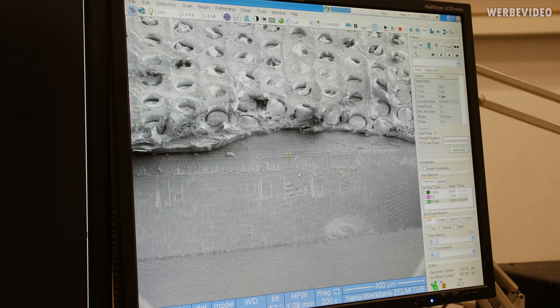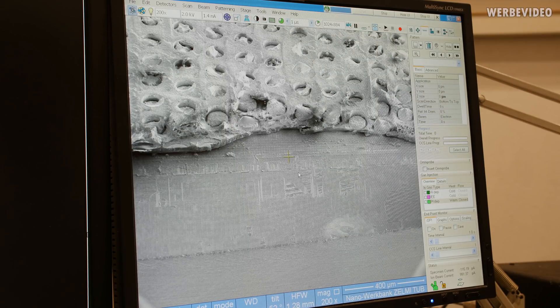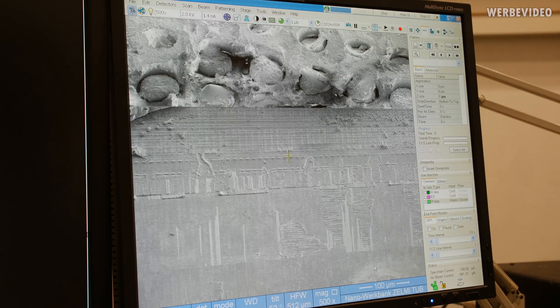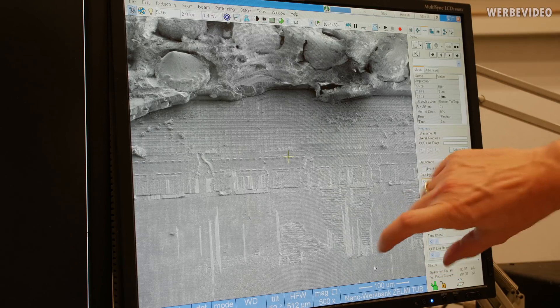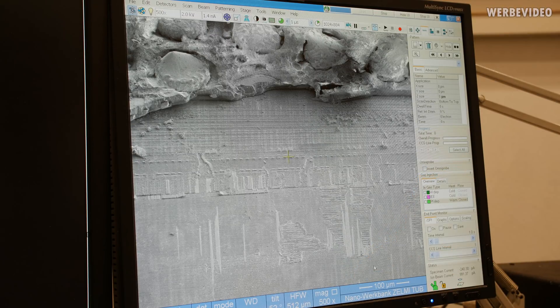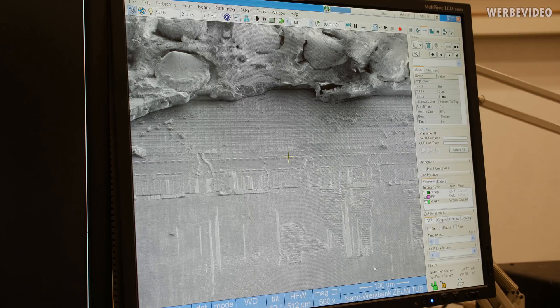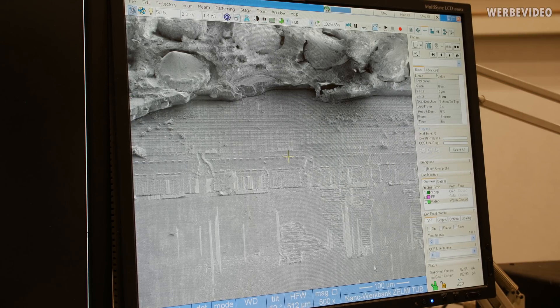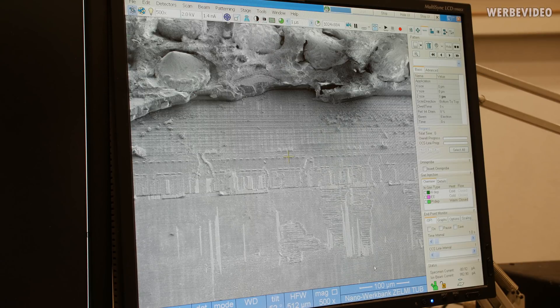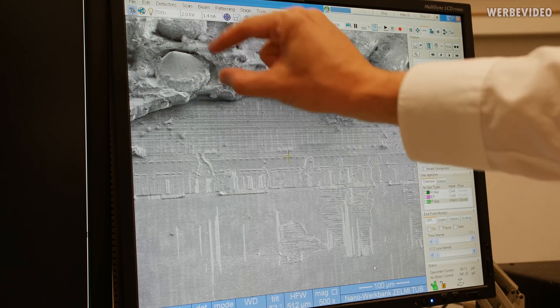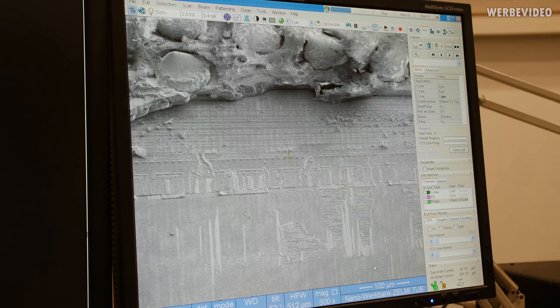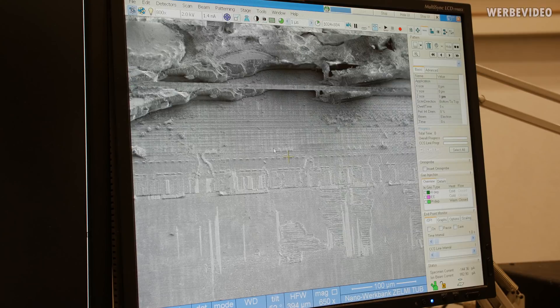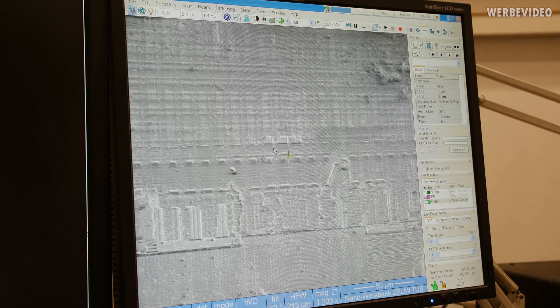Can you give us a relation to what kind of magnification we are looking at currently? Yeah, so first I'm going to increase the magnification. And now we have the scale bar here. And the scale bar now says 100 micrometers. And this is above the size of a human hair. So typically, human hairs have a diameter of 60 to 80 micrometers. And you can see that the solder bumps have the same diameter. And all of these semiconductor structures are much smaller compared to the size of the human hair.